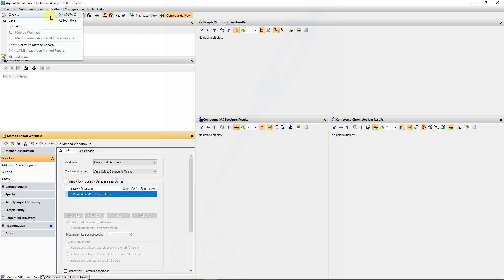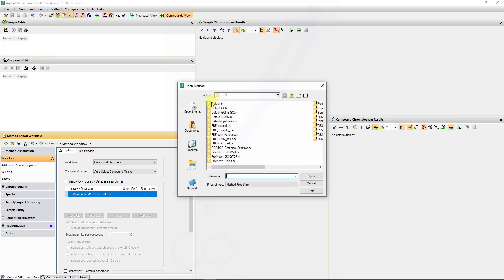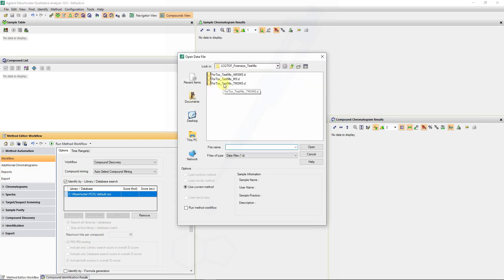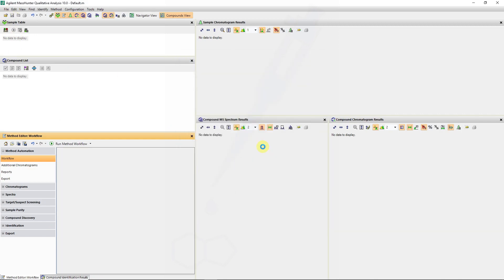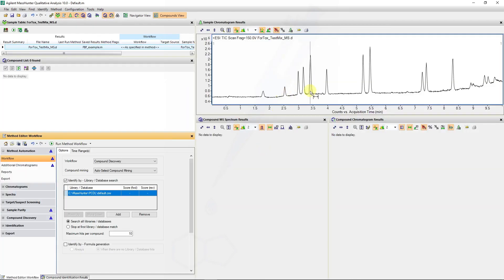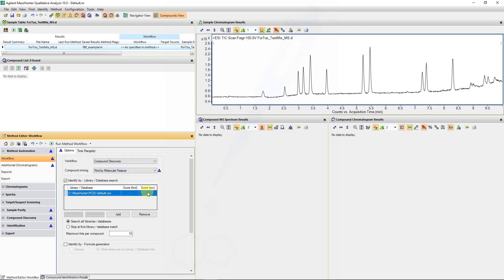I am going to open my default method to ensure that all the parameters are reset to the default settings, then open my data file. In this case, I'm using a MS data file where data has only been acquired in the TOF MS mode. For compound discovery, we now have a limited number of compound mining algorithms depending on the data type loaded — that is TOF MS data.